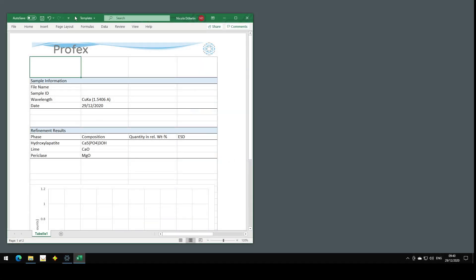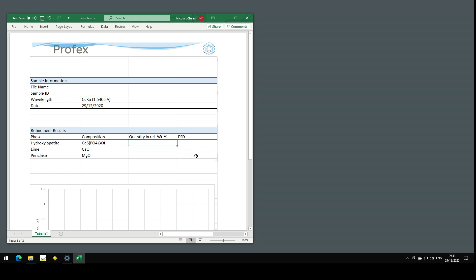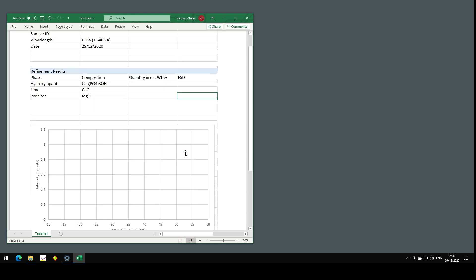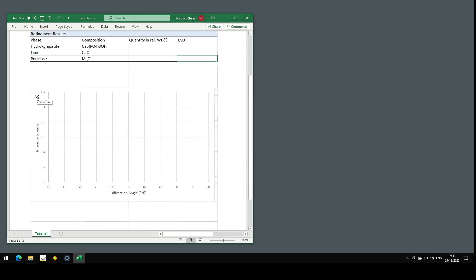I have an empty results sheet in Excel here, with cells for some sample information, for example the filename and the sample ID here, and for the quantification results down here. And I also inserted an empty graph, where I want to show the diffraction pattern down here.